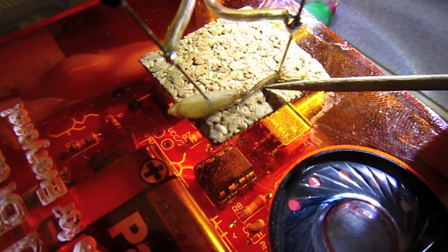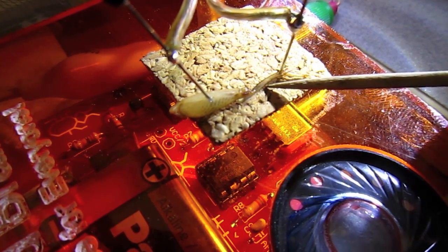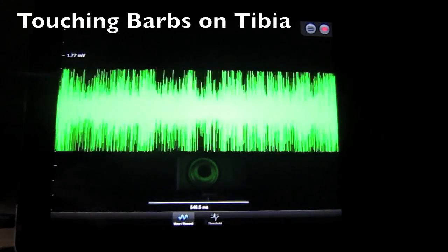Now let's put one electrode in the femur and one in the tarsus. This has a very high spontaneous discharge rate and is also very sensitive to touching the barbs on the tibia.